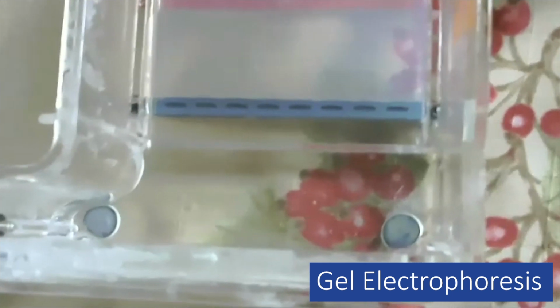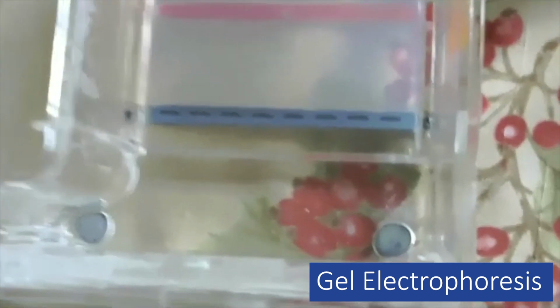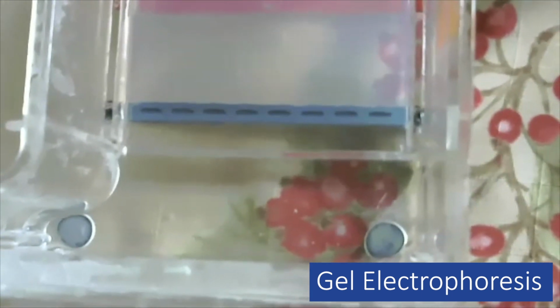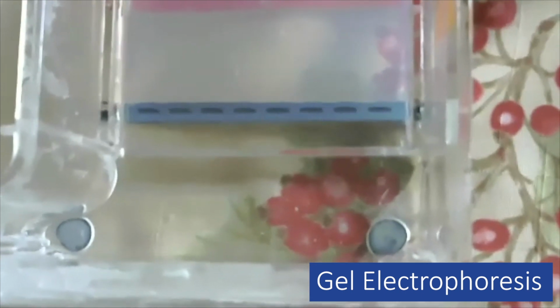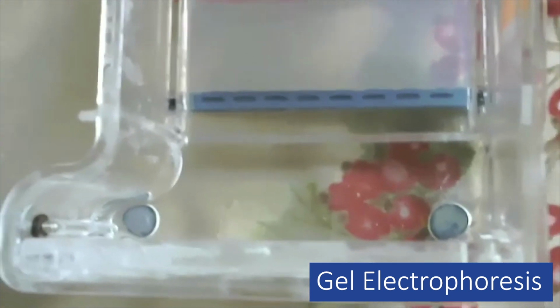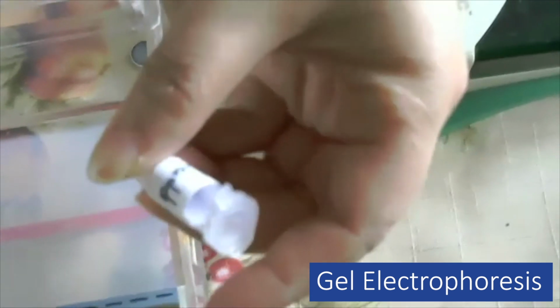So when you load the sample, the first lane should be the ladder, okay? So we usually load 5 microliters of the 100 bp DNA ladder there. Okay, so we are going to use the smallest micropipette and change the reading to 0500, okay?